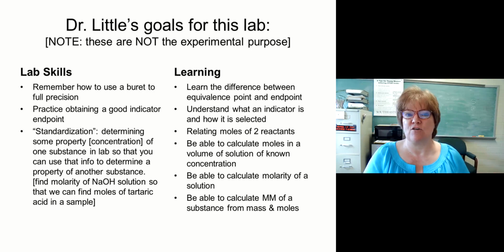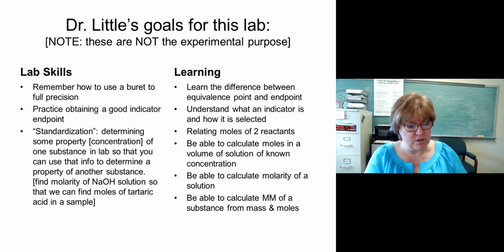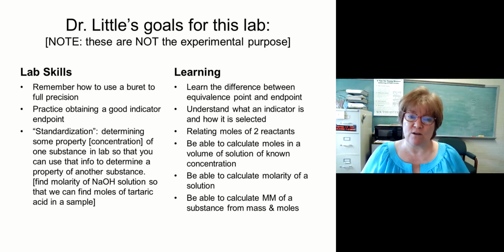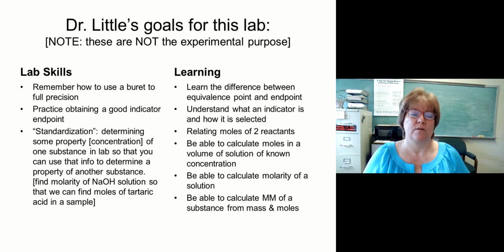Usually when we talk about standardization though, it's finding the concentration of a substance that is probably not stable. And very few things are stable. Even if I wanted to create a solution and put it on a bench and put a sticker on it and say it's this concentration, if I want to know that concentration to 4 significant figures, that's not realistic. It can't sit there for months and be stable. It's going to change from day to day, week to week.